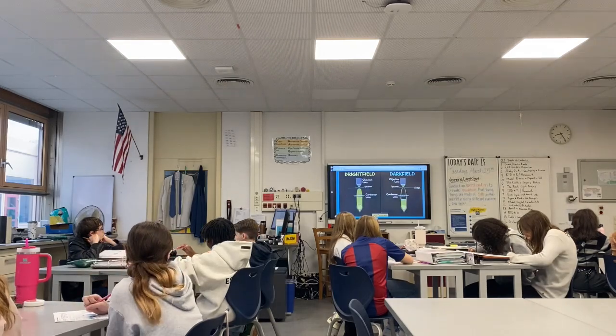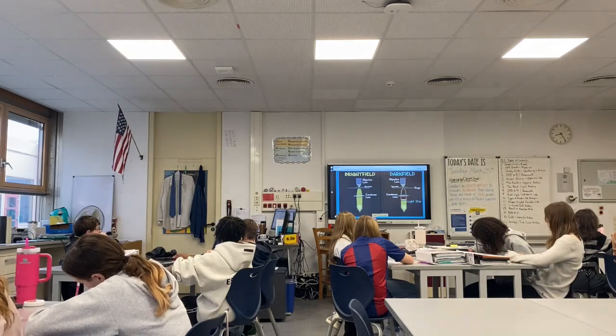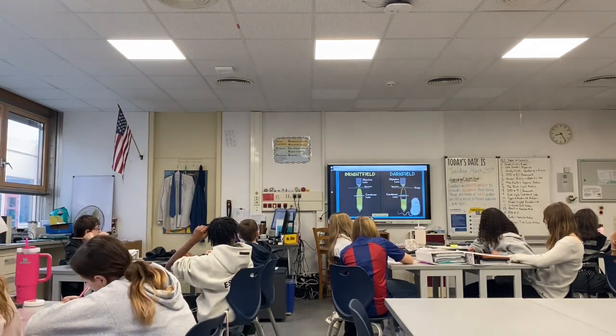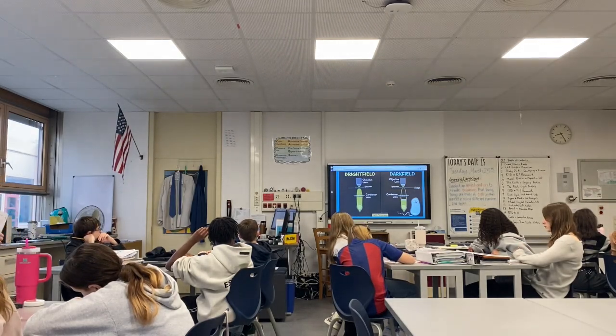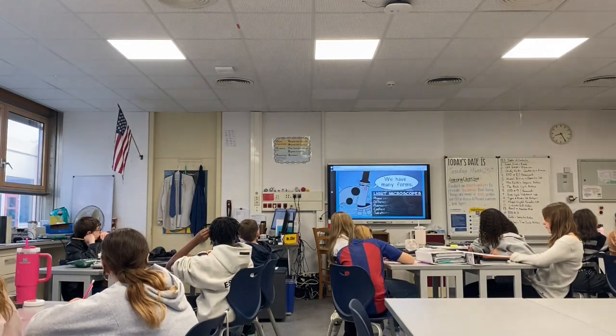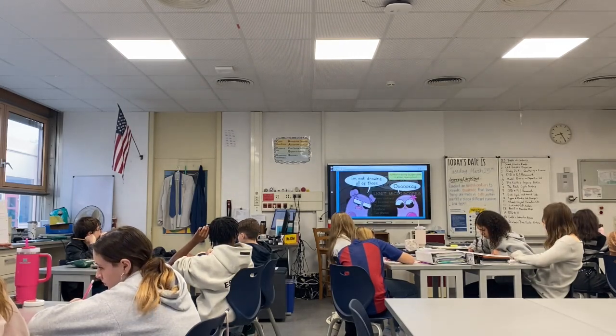With a dark field light microscope, you have a piece that blocks the light source, called a light stop. The idea is that most light has been blocked, so the only light you see is light reflected or refracted from structures within the specimen that you're looking at. So you tend to see light images on a dark background. There are many other types of light microscopes too. We have a great link for further reading suggestions to learn how each of these work.